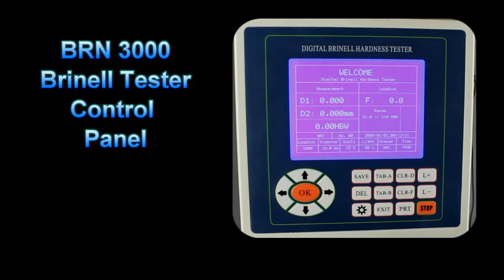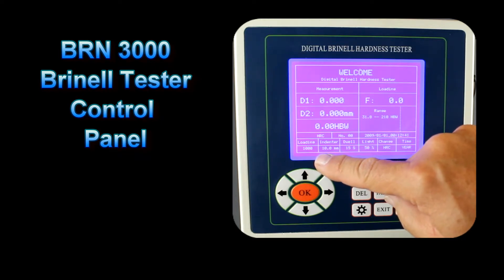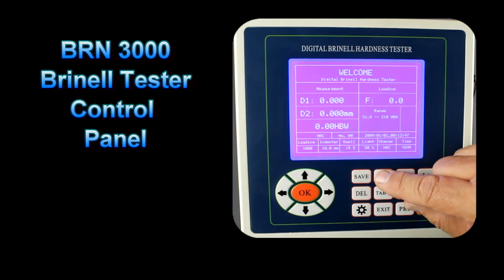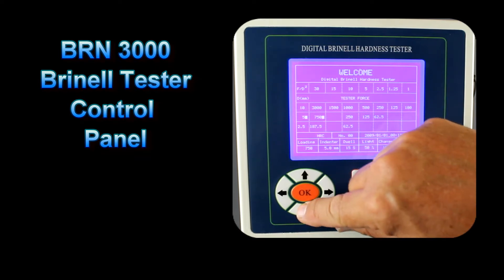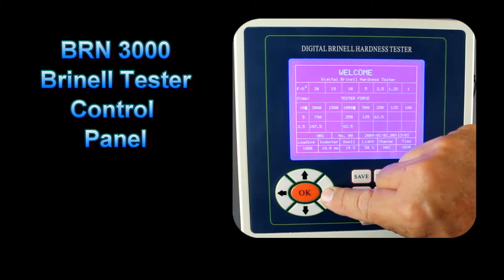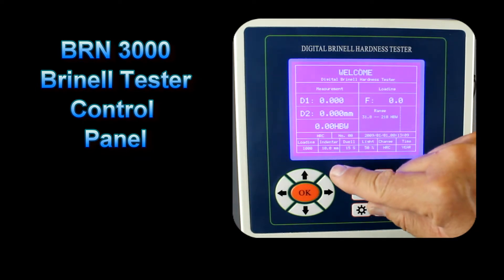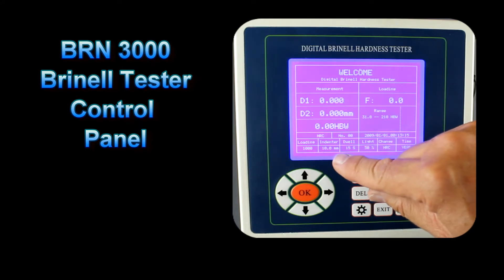The BRN3000 control panel overview: when we first turn on the unit, the LCD display will show the default values at the bottom. To change the load and indenter size, we go into the Tab A key. When we press that, a settings screen comes up. By scrolling down we can change the indenter size, and scrolling to the right we can change the load. Let's select the 1000 kg load. When we press OK, we return to the main screen and we can now see the setting for 1000 kg load and a 10mm ball.